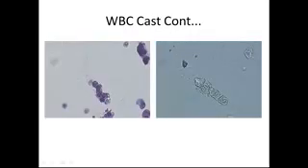So here's another example, and you can see this one has a little bit of stain to it, so it dyes the white blood cells quite nicely and highlights them. And here's another one.